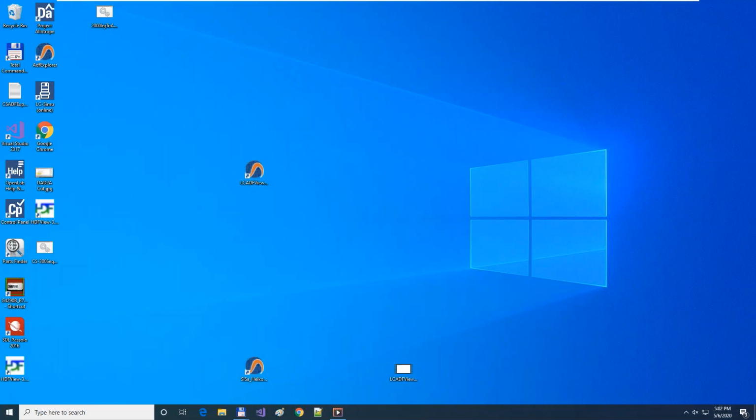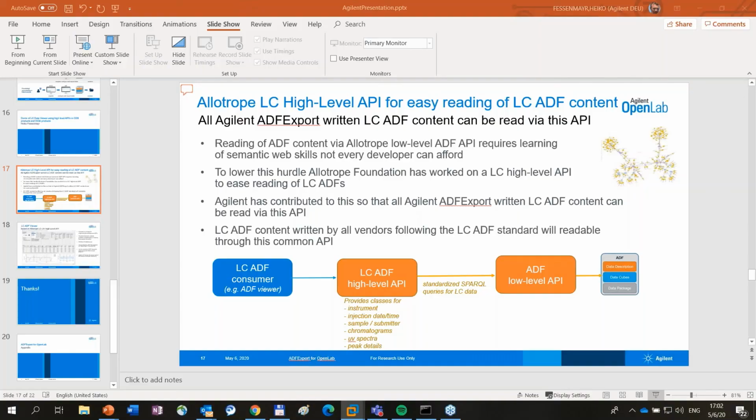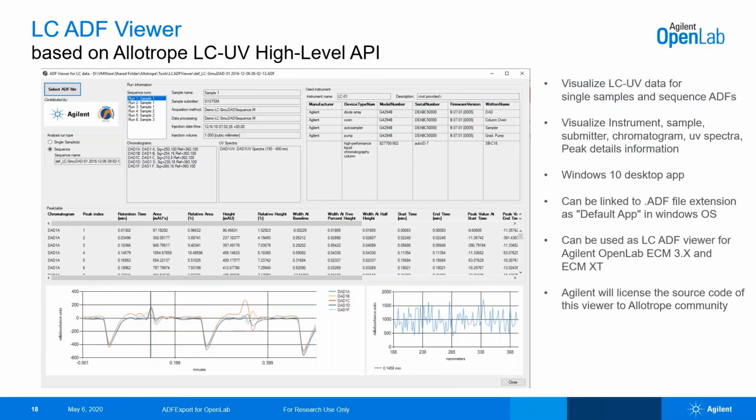Okay, thanks. Because the example you showed looked like it was static and you couldn't zoom anything. I've seen other examples from ADF which were really complicated, but here, for example, this looks like a static sheet. Therefore, that was my question. But thank you.